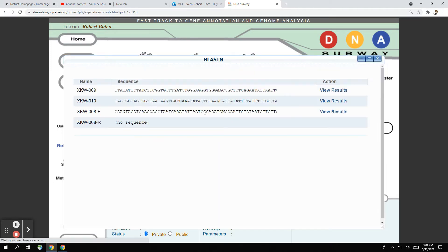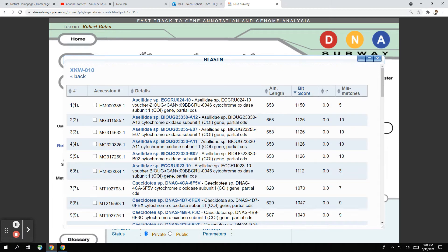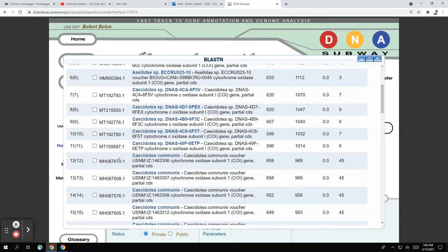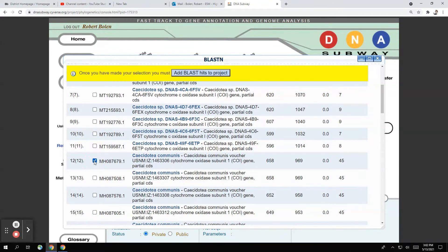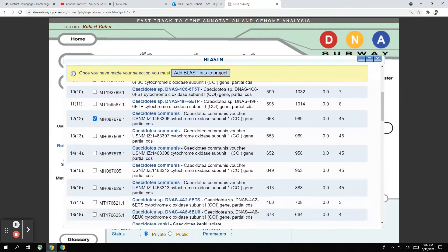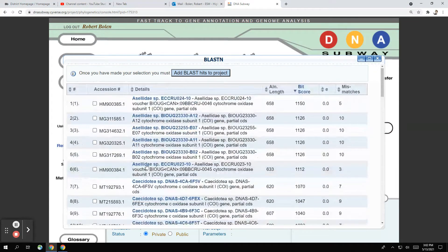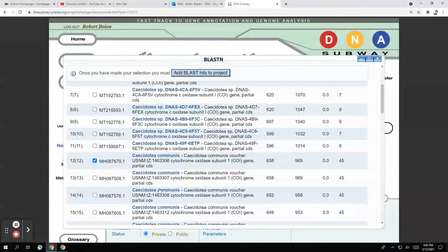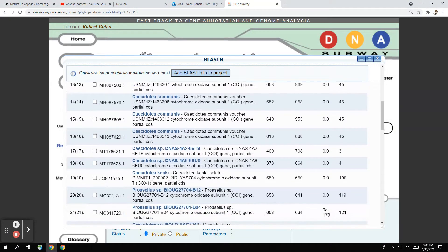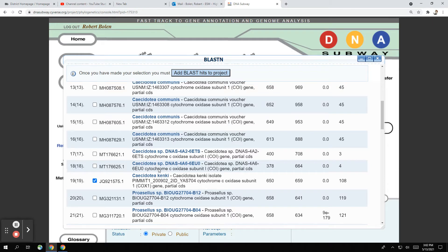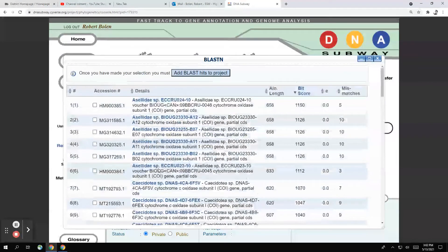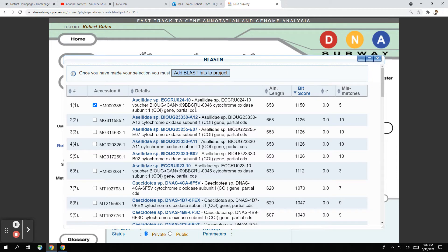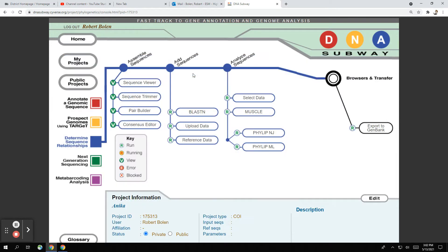Then we're going to go back and we're going to do the next one. And the same thing, this looks very similar. So we'll scroll down and we have a pretty good match here. Not a lot of variation. We'll do the same thing. Anywhere where we see a genus and species name, we'll do Caecidotea kenki. And again, just for reference, we'll hit this top one. That's our number one hit. And we'll add that to the project.